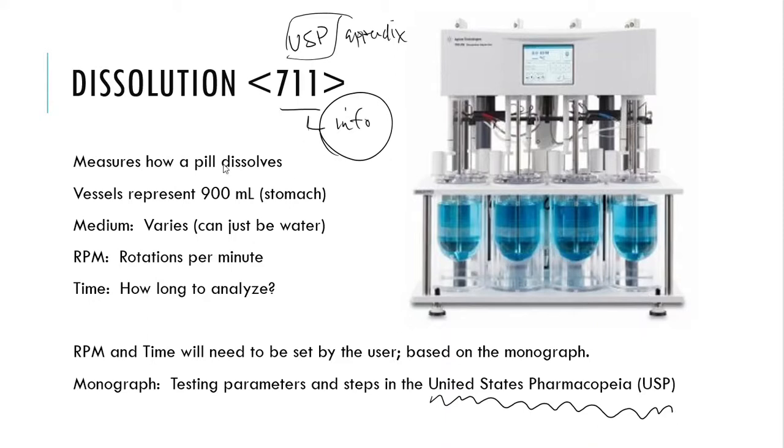Well, it basically measures how a pill dissolves, folks. I mean, that's what it does. So what will go on is that I will have a pill, and I will eventually take this pill and, boop, drop it down into the vat of solution. And there is a paddle. You can see that in the image. There's a big stainless steel rod that goes all the way down. And we see a paddle down here at the very bottom.